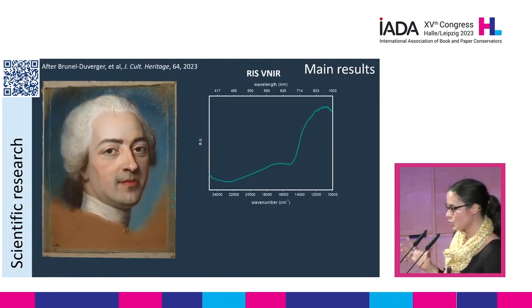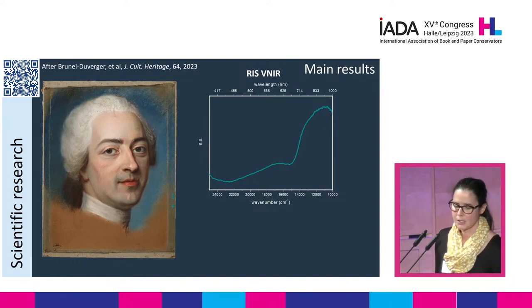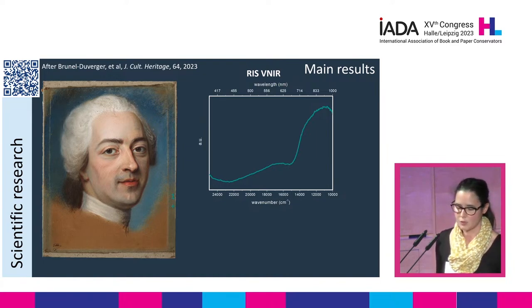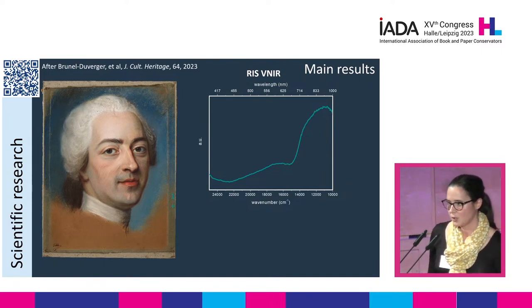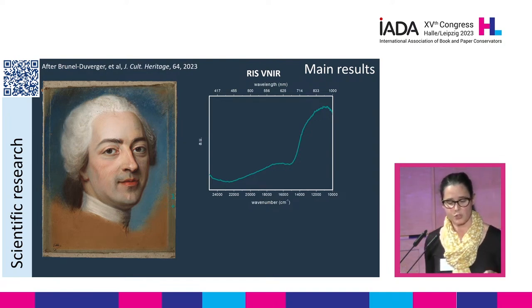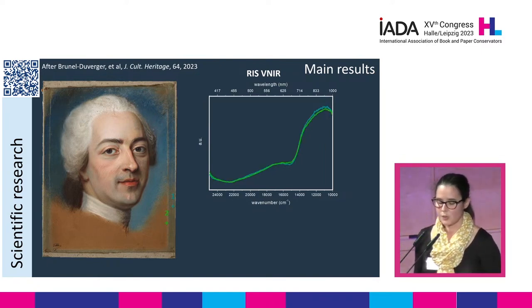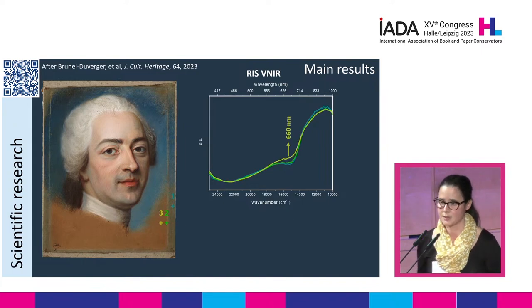But this is now where I'm going to give you some of the most relevant information you can get from this technique. The full details are available in the article that we just published, so if you want to see the scientific results, they are out now. But let me guide you through the type of information we found. Looking at Louis XV, we looked at spectra in the visible near infrared range. The first spectrum, number 1, is in the preserved blue area. We then moved to the edge where this color shift happens, and more inside the actual yellowed and discolored area.